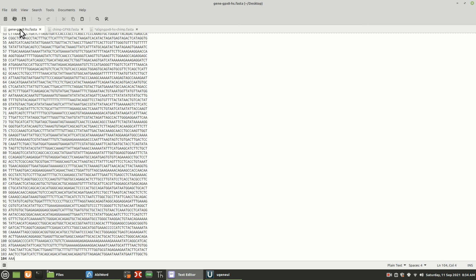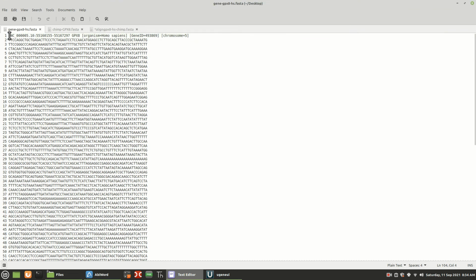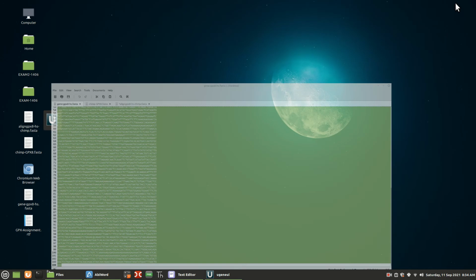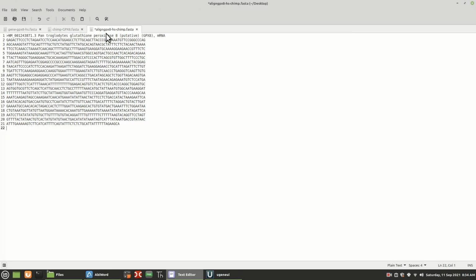It's going to be our third one here. I'm going to paste that one in, and then I'll go over here to the human one, and I'll leave a space, and I'll paste that one in. Oops, I shouldn't have closed it. It's right here. All right.